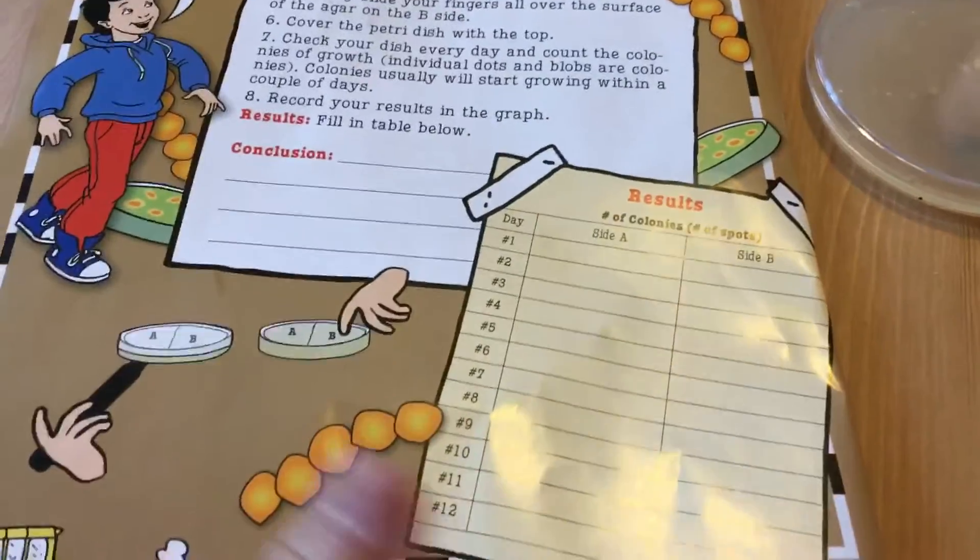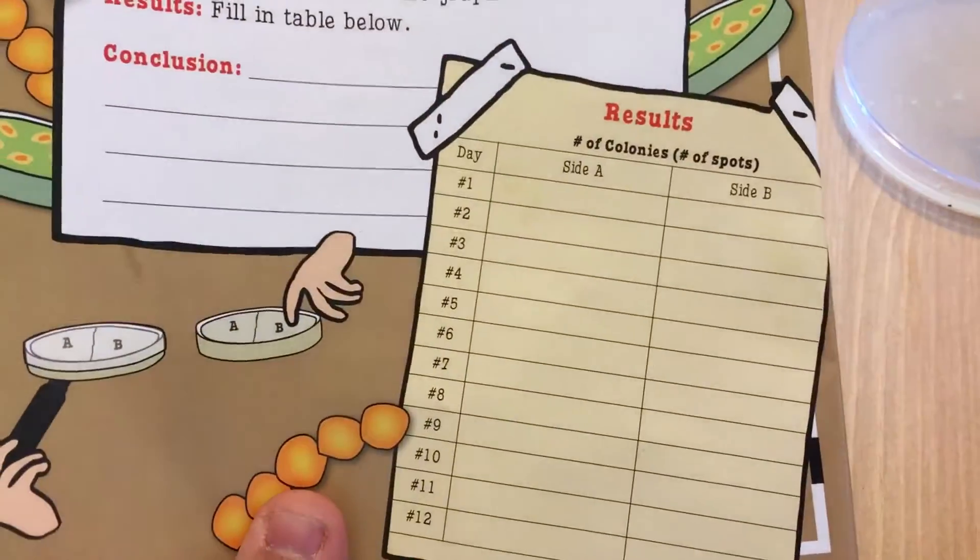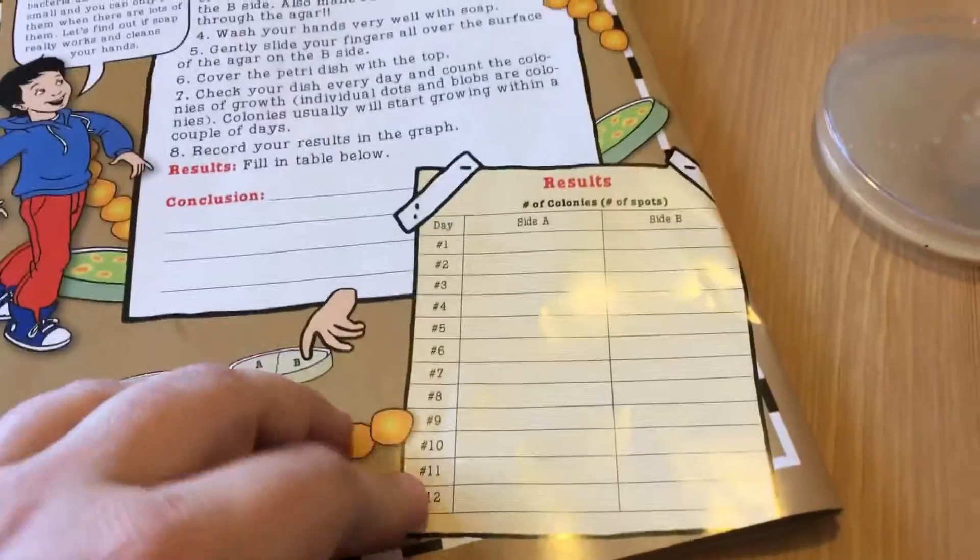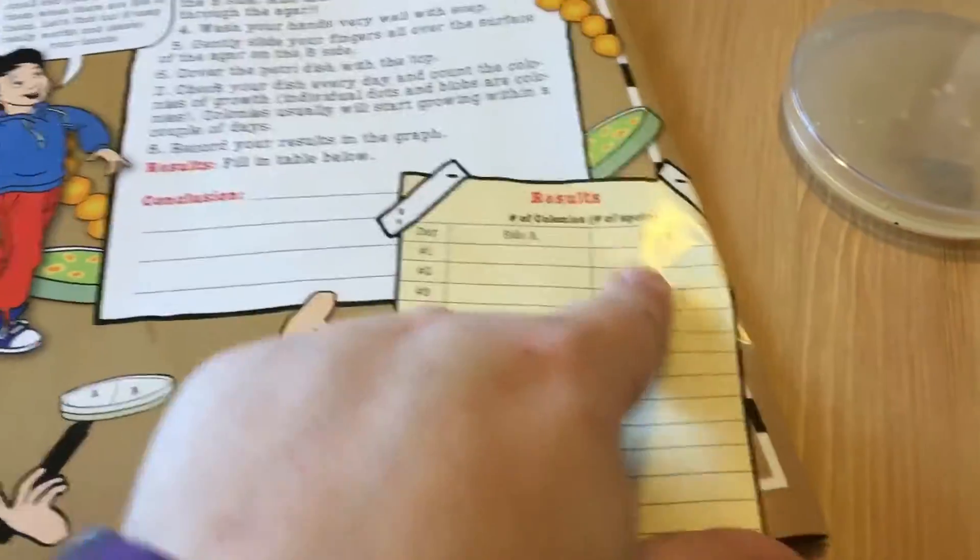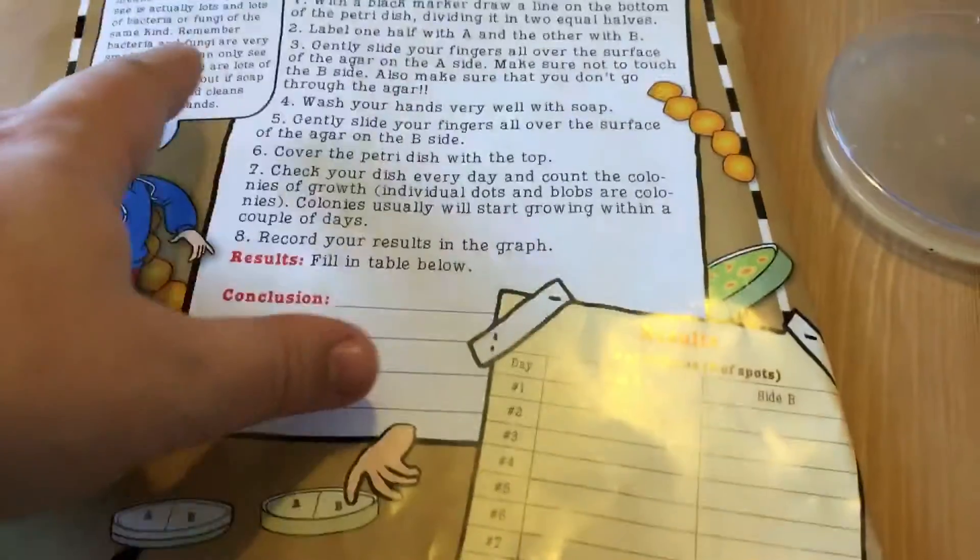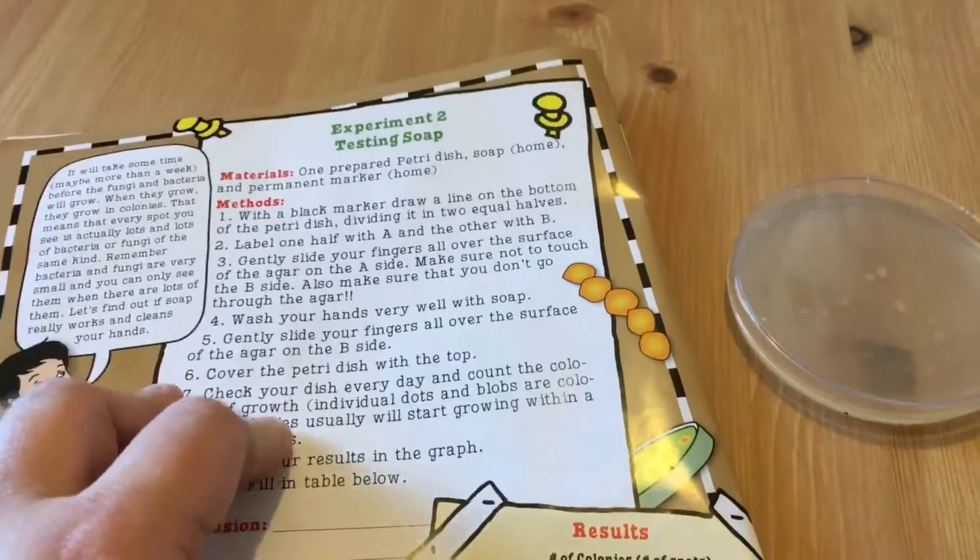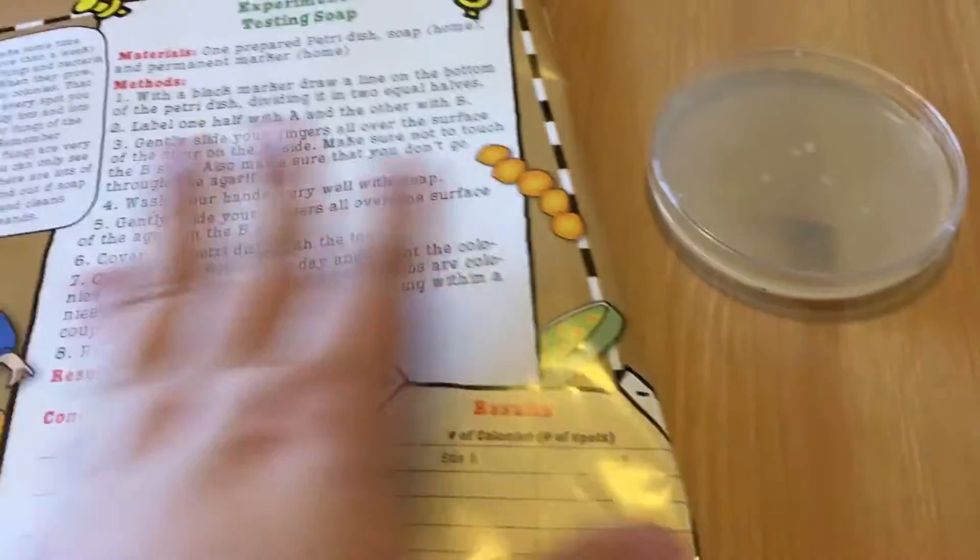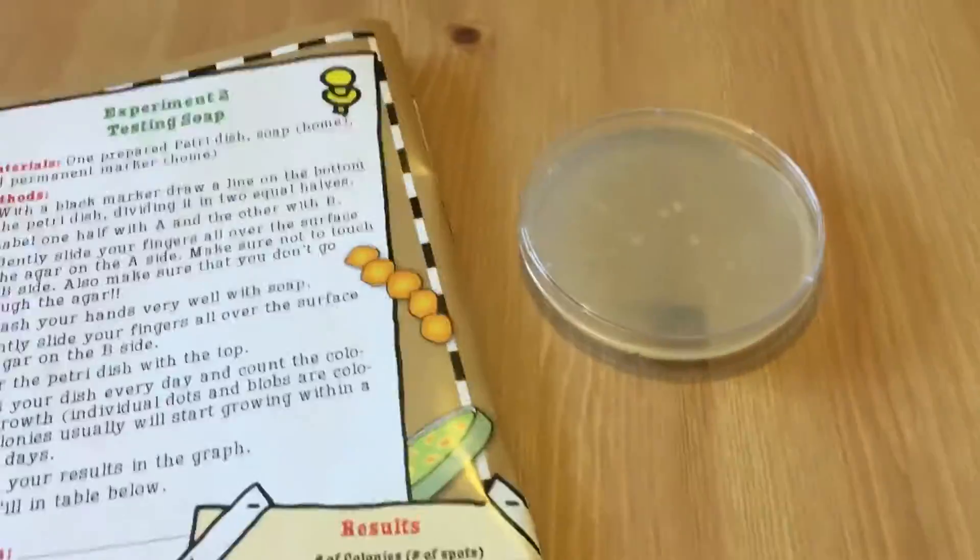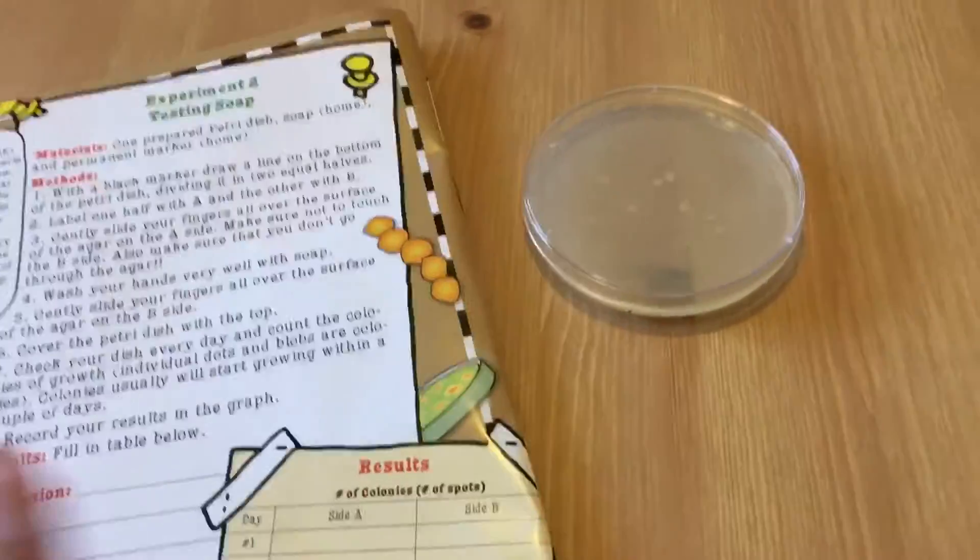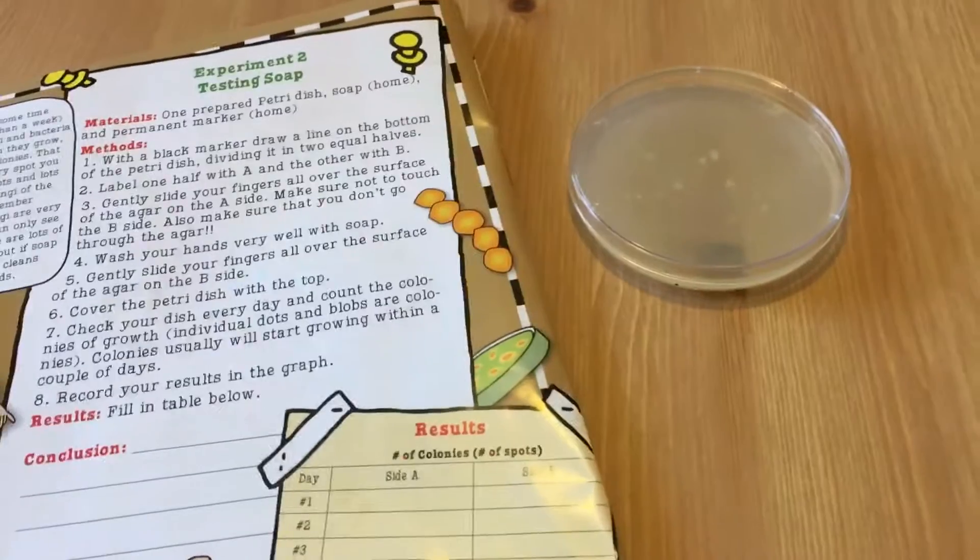We're also going to make a list. I'm actually probably going to draw this on the dry erase board and we will keep track of what's growing, how many colonies we have. This does say it may take up to a week for growth, so it's kind of a be patient and watch it each day thing. So we are going to go wash our hands and I'll show you how we gently rub our fingers over the agar.